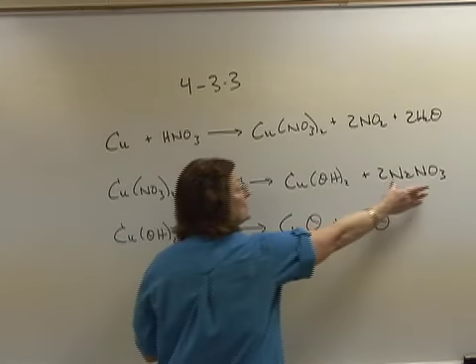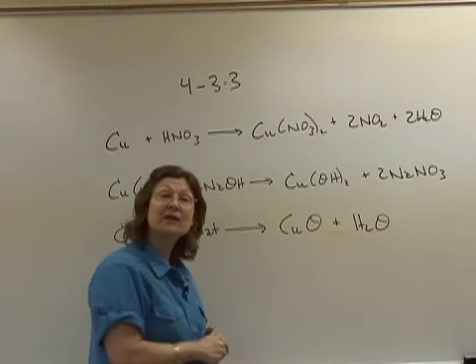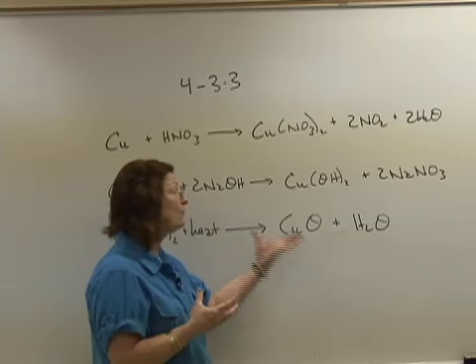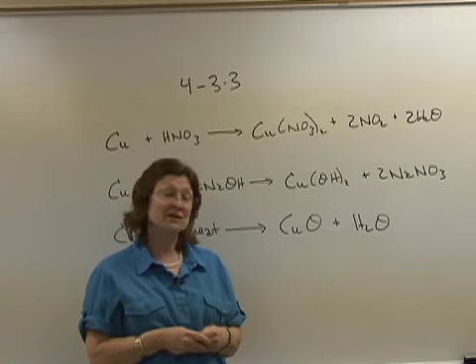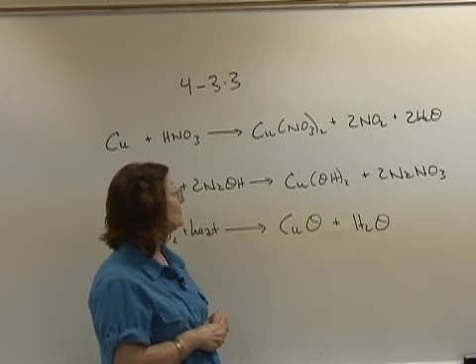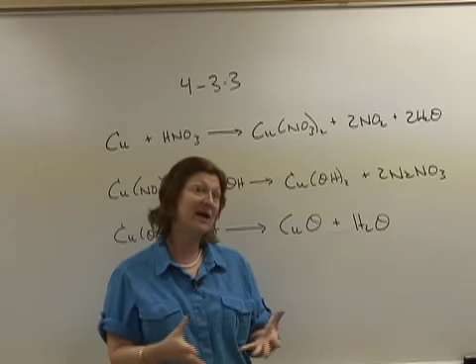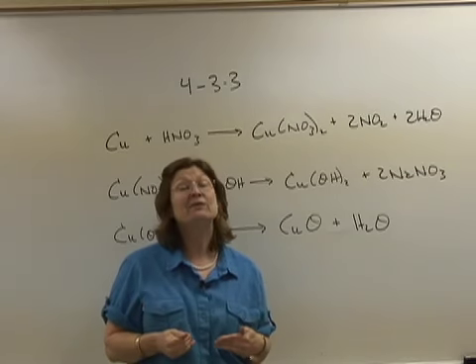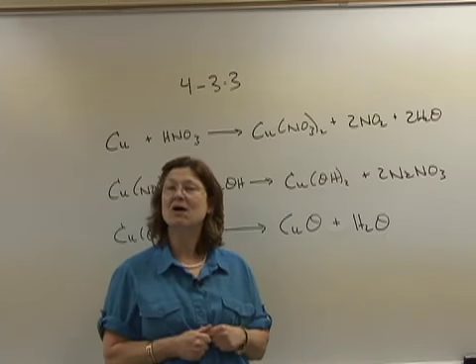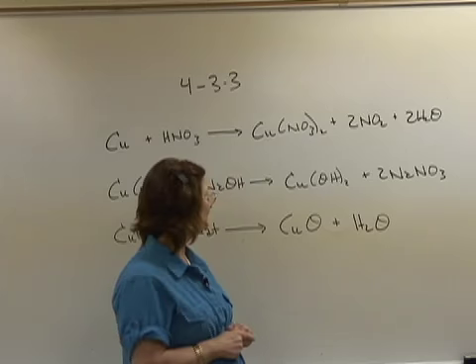There are 2 things that are formed here, and there may be some sodium nitrate ions that will attach to the solid, and we want to wash them off because we don't want them adding mass to our materials. Normally I grade this on accuracy, so depending upon how close we get and what percent yield we get will determine what percentage of that 20 points we get on the lab. So hopefully we're going to do it very, very carefully.